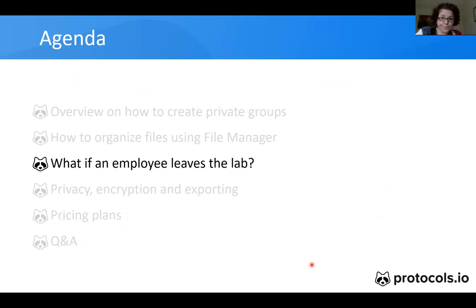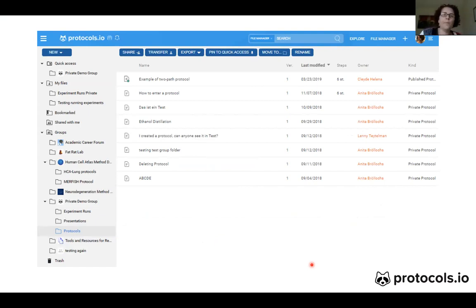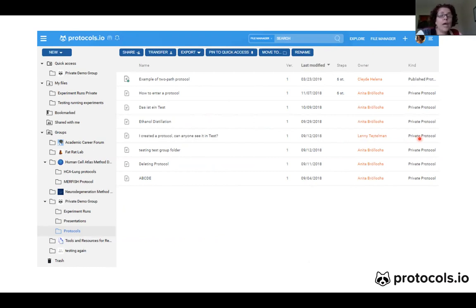What if an employee leaves the lab? Protocols are never deleted from our website. As an admin, you can transfer the ownership of a protocol from one group member to another. For example, here is our protocols subfolder under the private demo group, and you can see that Lenny has one private protocol. Let's say Lenny is leaving the company.